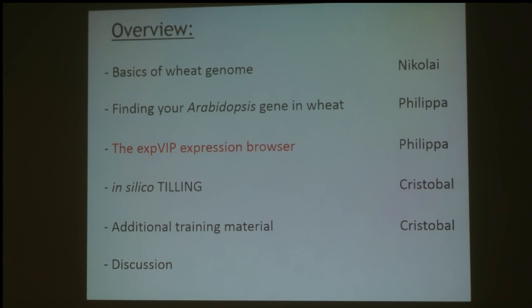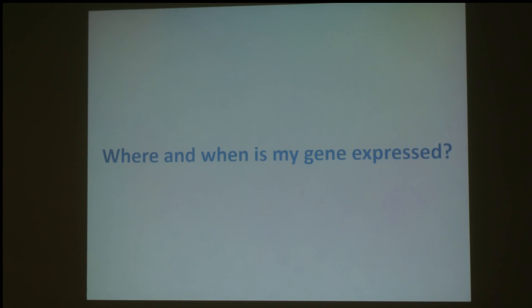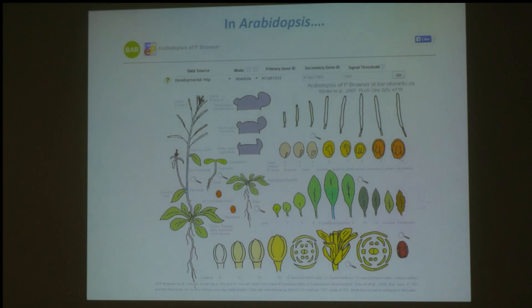Then we'll move on to the expression browser. One of the first questions you might have when you start working on a gene is what's it doing? One way to start addressing this is: where and when is my gene expressed? In Arabidopsis there are some very nice resources, such as the EFP browser, where you can search for your favourite gene and see where it's expressed across all the different tissues and ages of the plant.